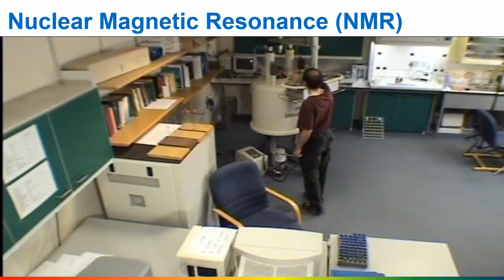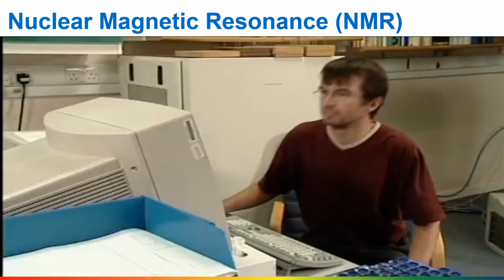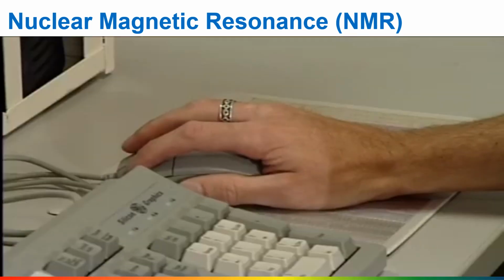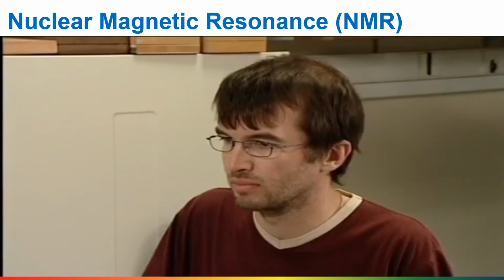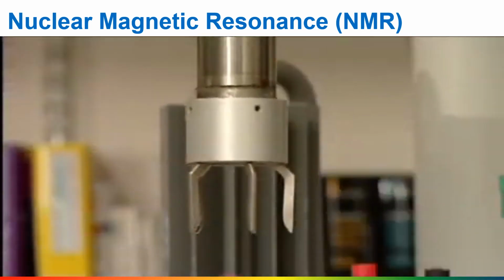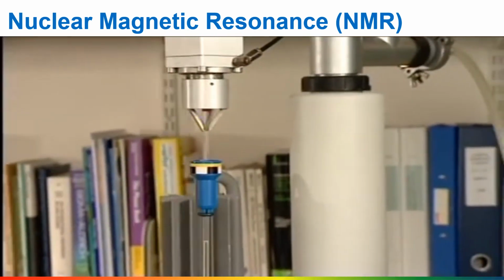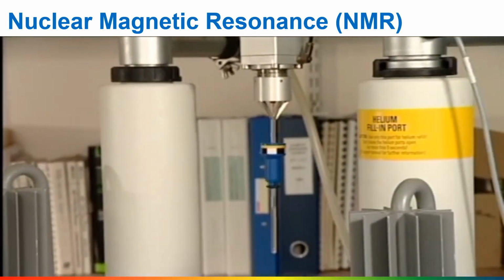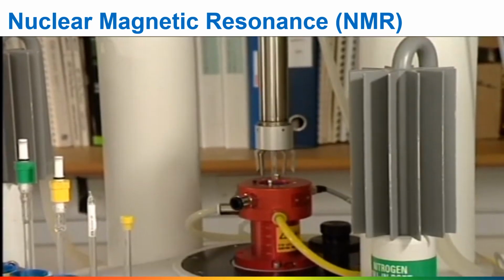The operator places the sample in the auto changer and tells the computer the identity of the sample and which position in the carousel it is in. The auto changer selects the correct sample and places it in the instrument. The sample is lowered gently into the probe on a cushion of nitrogen so that it sits in the centre of the magnetic field and the radio coils.